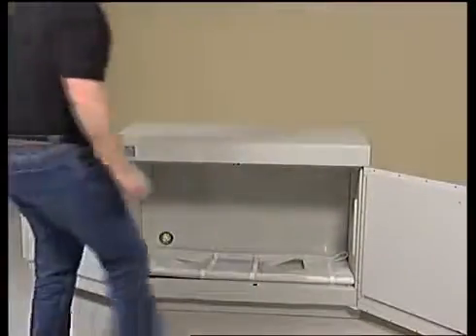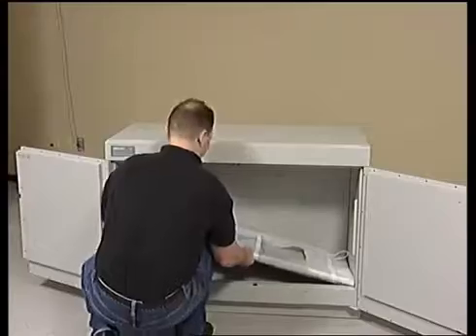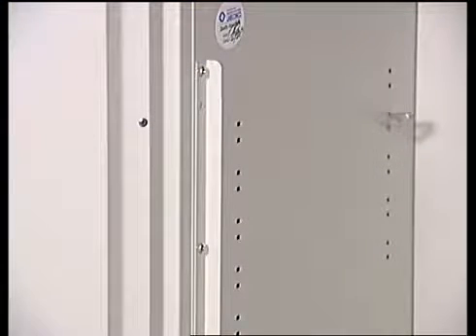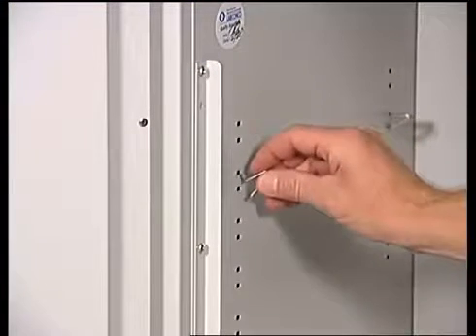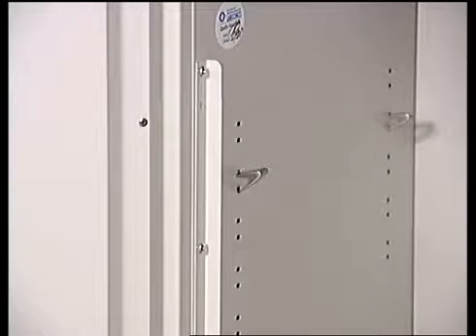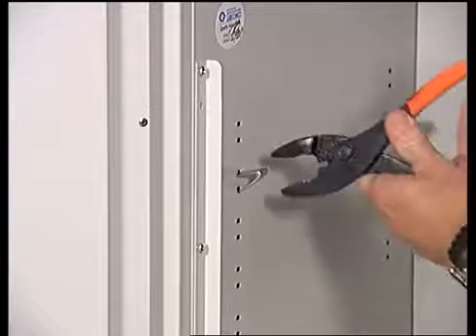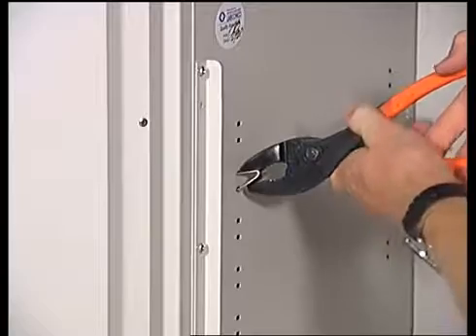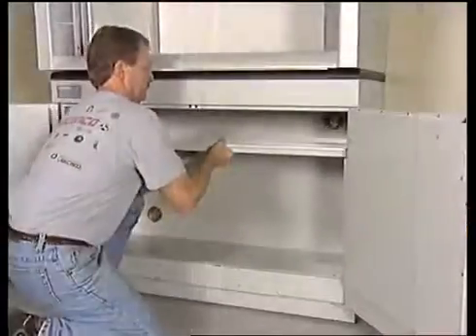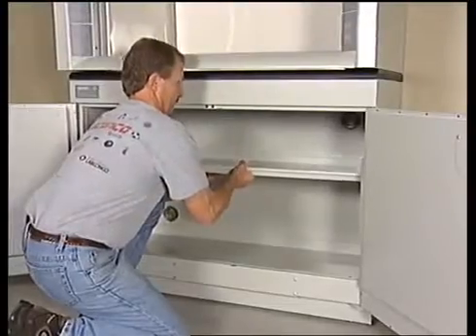Your solvent storage cabinet comes with one adjustable shelf. Locate the four shelf brackets included with the cabinet's leveling feet and place one bracket in each of four matching shelf positions located on the interior walls of the cabinet. Make sure that the shelf brackets are located at the same height to ensure that the shelf will be level when placed in its final position. To install, simply squeeze the shelf bracket with pliers and place in the shelf positions of your cabinet. Lift the shelf over the brackets and lower into position.